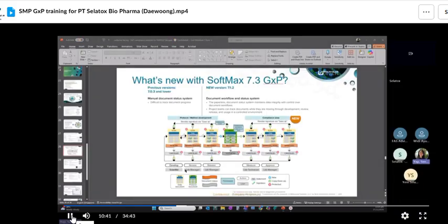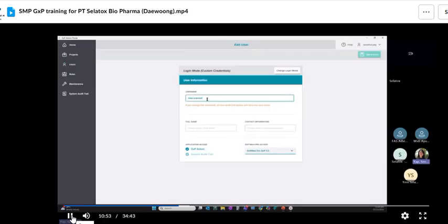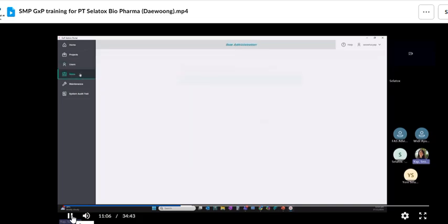Okay, you will have a default scientist, lab manager, and lab technician in this user list. Feel free to make changes. The name can be changed accordingly. For example, scientist, I change the name to med scientist. It's up to you. You can amend or change the role, with a different role name accordingly. So that is something you can do.